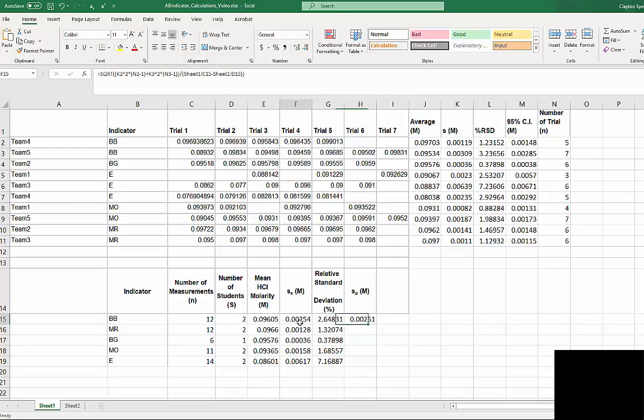So this is not the total standard deviation, sort of pooled all the data together, but here we're weighting each standard deviation from each student group. So that's another measure of standard deviation. They aren't too far off from each other.